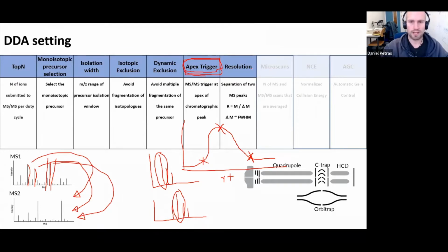All right, then coming to some more general settings, we can choose the resolution of the mass spec. In particular with Orbitrap analyzers, this is directly coupled to the actual transient time. So the higher your resolution, the longer you need to cycle your ions inside of your Orbitrap, and hence the slower the machine scans. So here it's a question of finding a balance, to get fast scan speed, but also high enough resolution. In particular, if you work with environmental samples and strongly mixed compounds, then it might be important to get higher resolution.